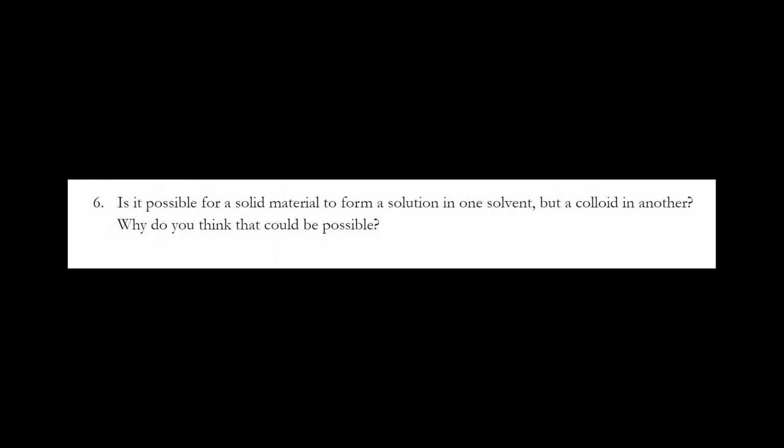5. Consider a mixture of a solid material and water that clearly exhibits the properties of a suspension. If you created a similar mixture but used a different solvent, such as acetone or vegetable oil, is it possible that the mixture could behave as a colloid instead? Why do you think that? And 6. Is it possible for a solid material to form a solution in one solvent but a colloid in another? Why do you think that could be possible?